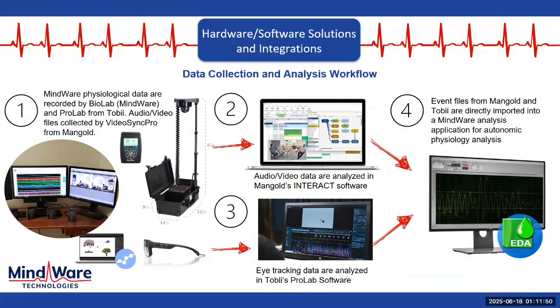An example here is the MindWare Mobile, which wirelessly pairs with our Field Laboratory Integration Platform, or FLIP for short. This is a way in which we can house the networking and a panel zoom camera. We can actually take this out to participant homes. It's small enough to fit in a carry-on bag on an airplane, so it's a really nice pairing between the two.